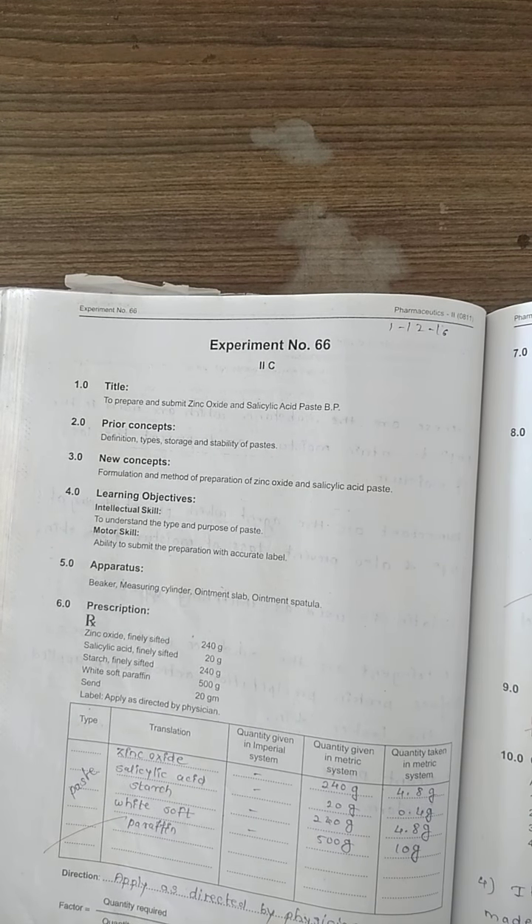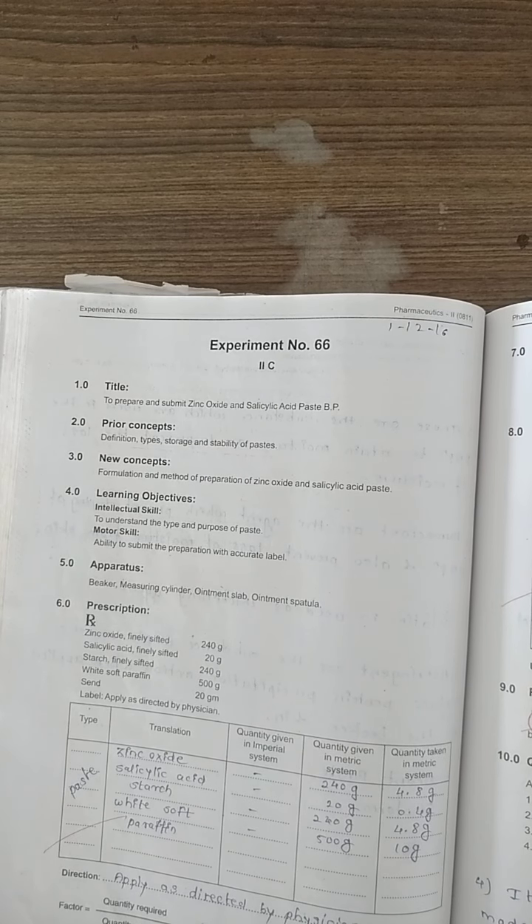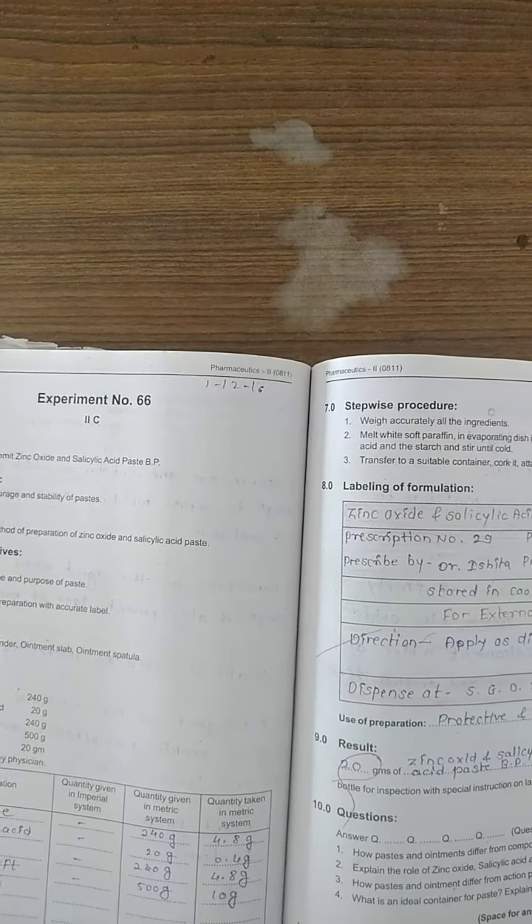Experiment number 66: same as per experiment number 65, we prepare zinc oxide and salicylic acid paste as per British Pharmacopoeia. Ingredients include finely sifted zinc oxide, salicylic acid, starch, and white soft paraffin — 20 grams total. The procedure follows next.